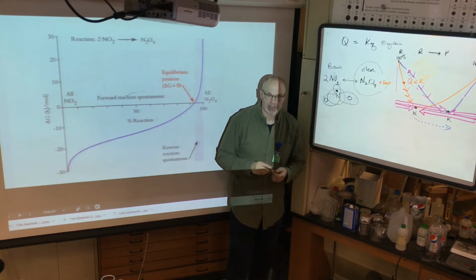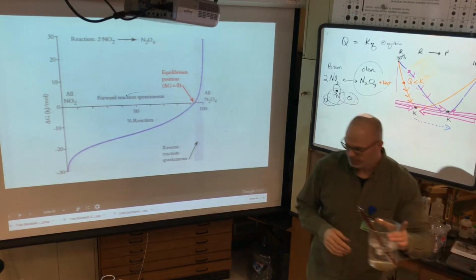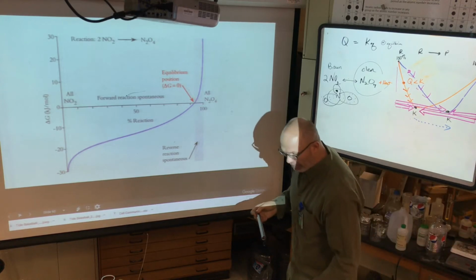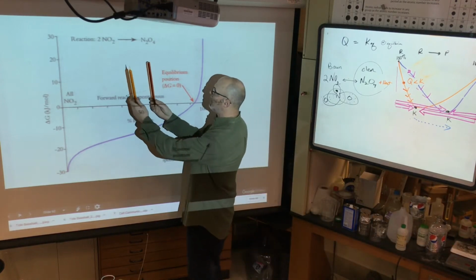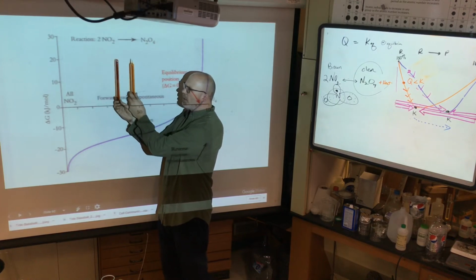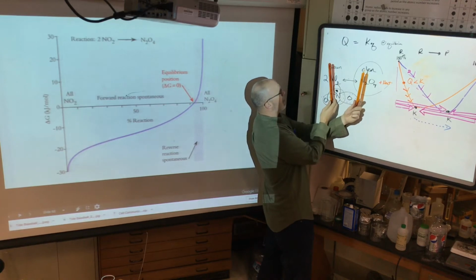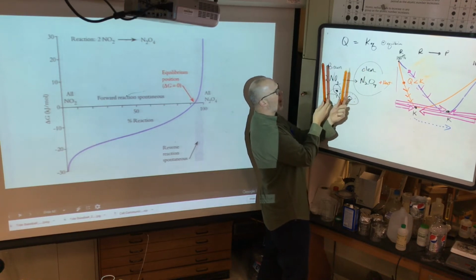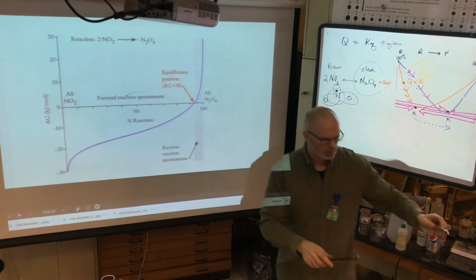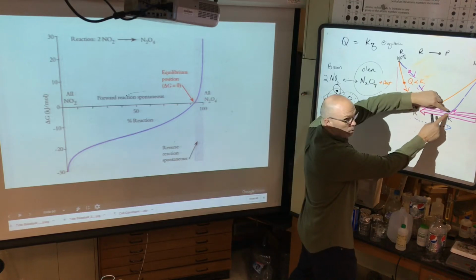Okay, well guess what? This should say the same thing. Ow, ow, ow. Okay, how about I just take the tube? Okay, here's room temperature. What did we get? We got dark. Why did it get dark? Because we made more what? Why did the reactants increase in number? Because the K did what in this case? It shifted. And when it shifted, we were at equilibrium.